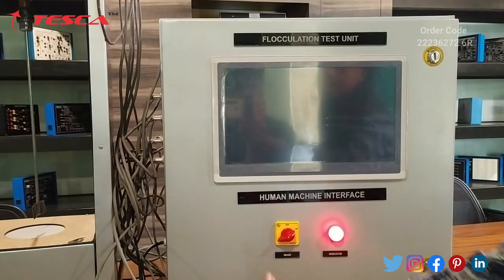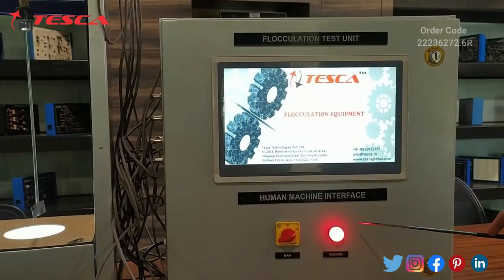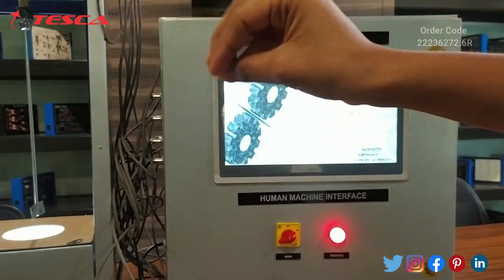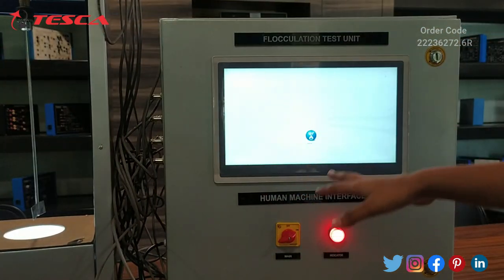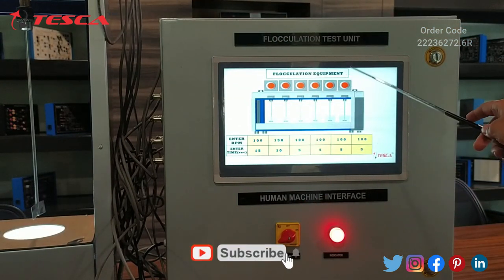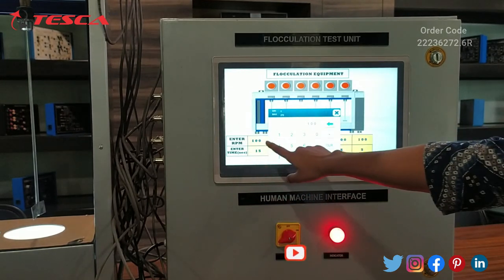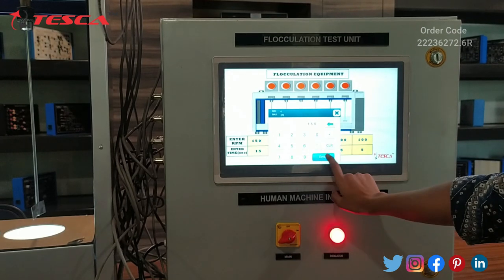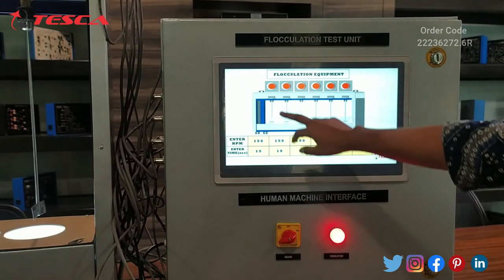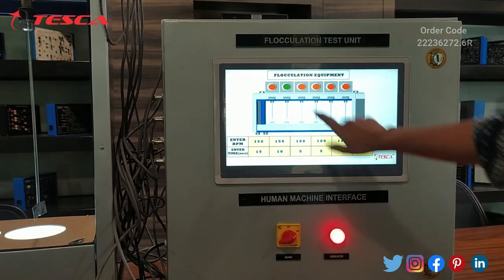Let's turn on the main switch of this control unit. This LED indicator shows the unit is on. We can control the RPM of each stepper motor individually and also the timer. From the equipment allocation screen, we can set the RPM of the stepper motor — let's set 150 RPM. We can also control the timer of the stepper motor and then turn on the stepper motor.